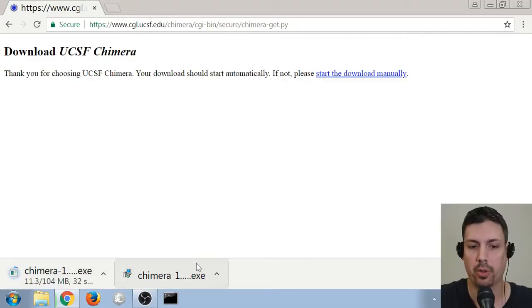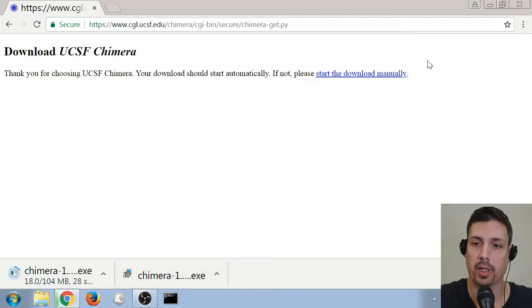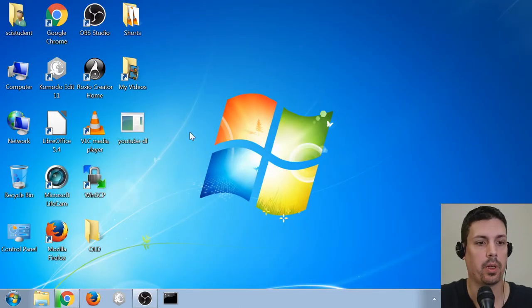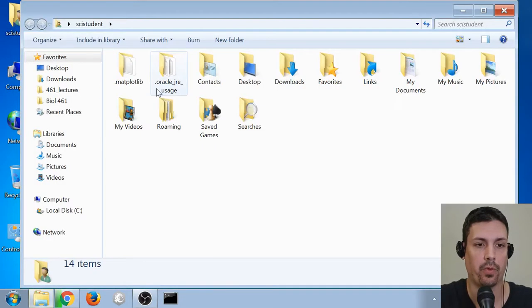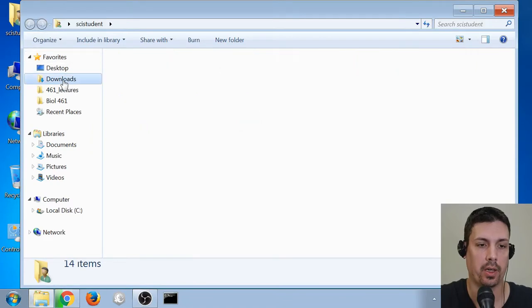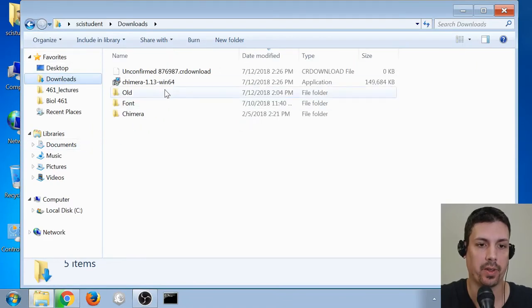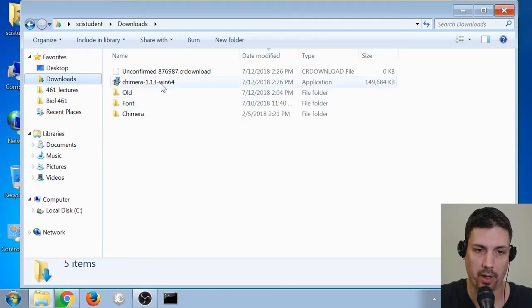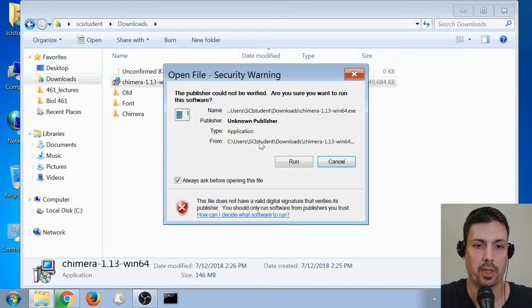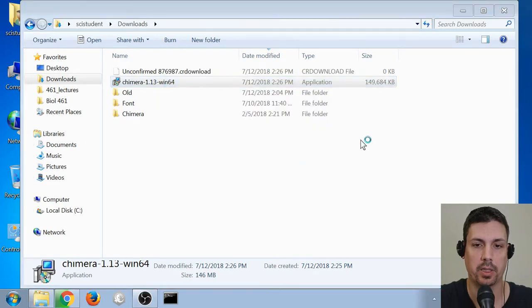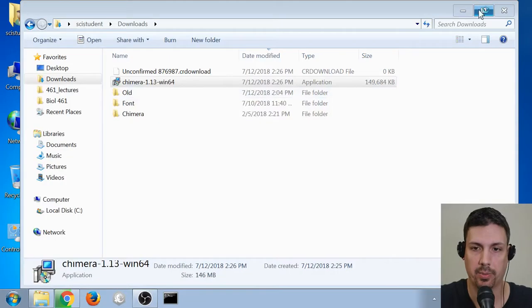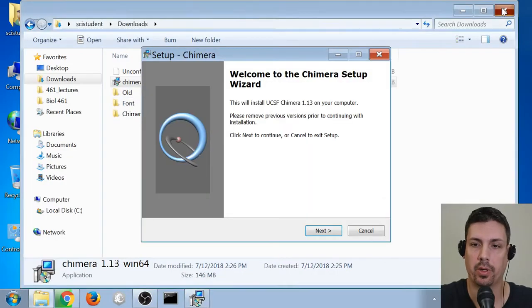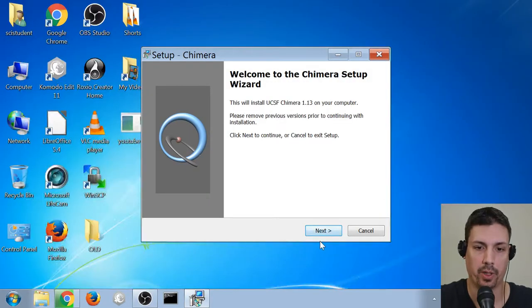For those people using Google Chrome or something similar, you can actually just double click here, and it'll run the program. But I'm going to navigate by going to my home folder, and then clicking on downloads on the side here, I can now find the Chimera installer. So I'm going to double click on that, click Run, allow it to make changes to my computer, I can close this big window here.